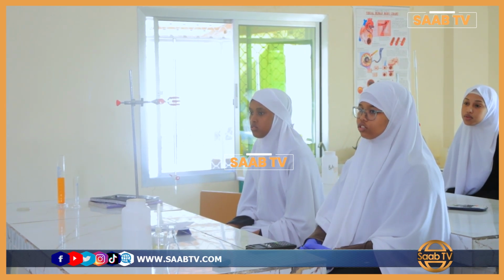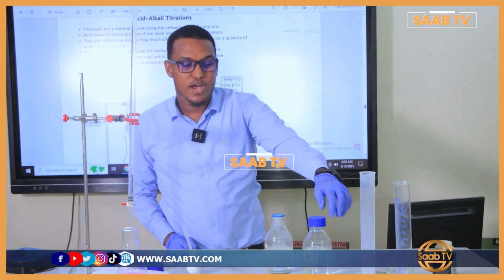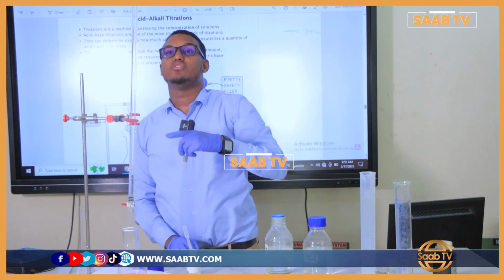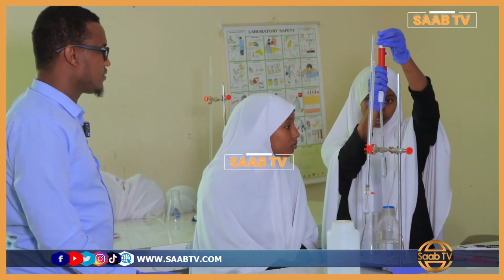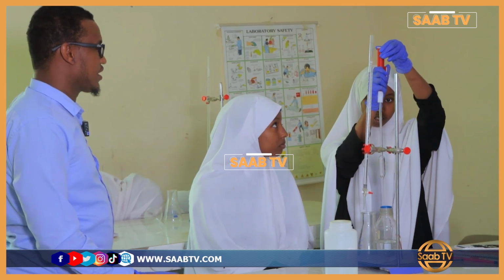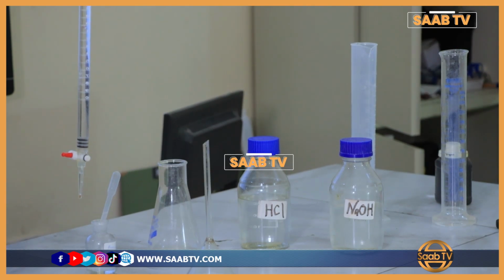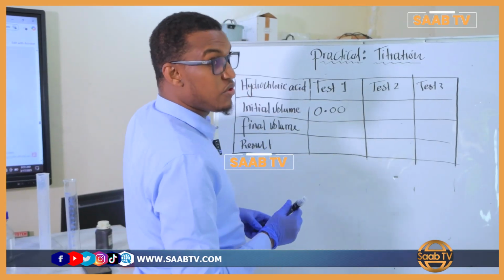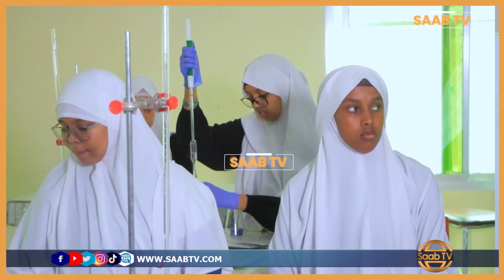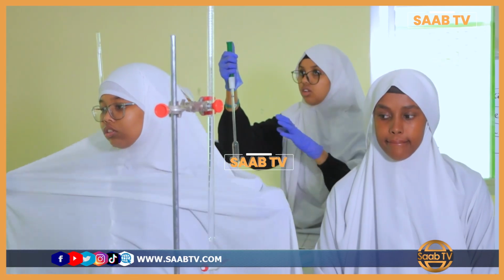So the first step we're going to do is measure the initial volume of the acid by reading the burette. The initial volume that we have is 0. So let me write the initial volume. Always we should use 2 decimal points. So the initial volume that we have is 0.00 cubic centimeters. Okay, so let me add the acid and then we will observe how the color is changing.